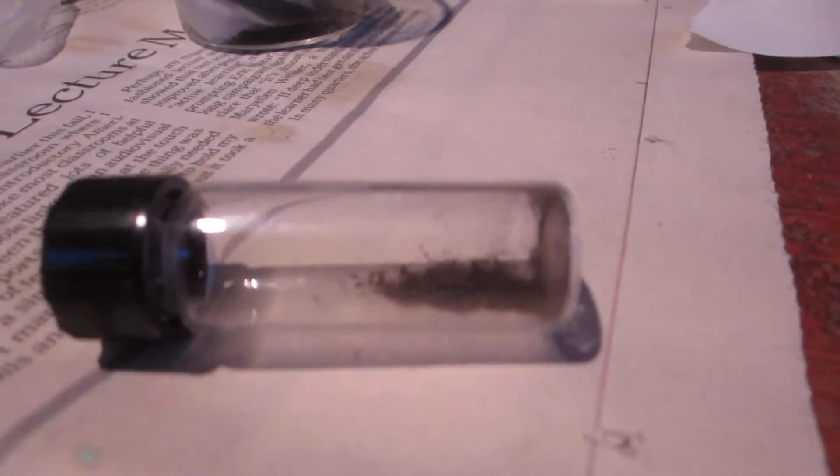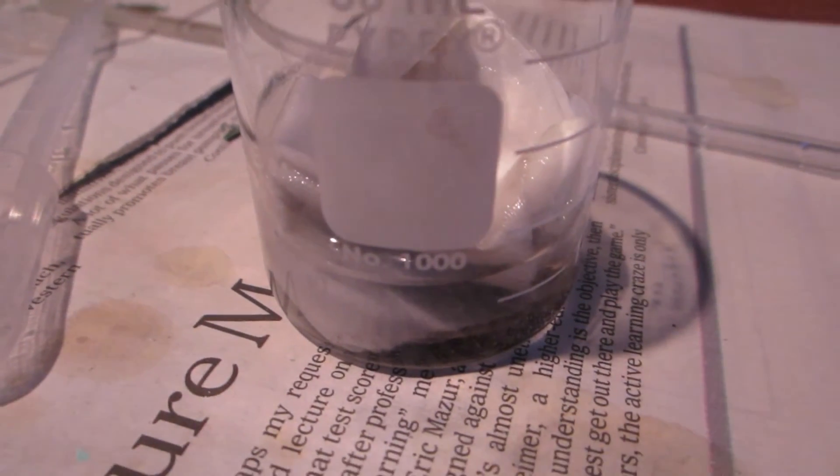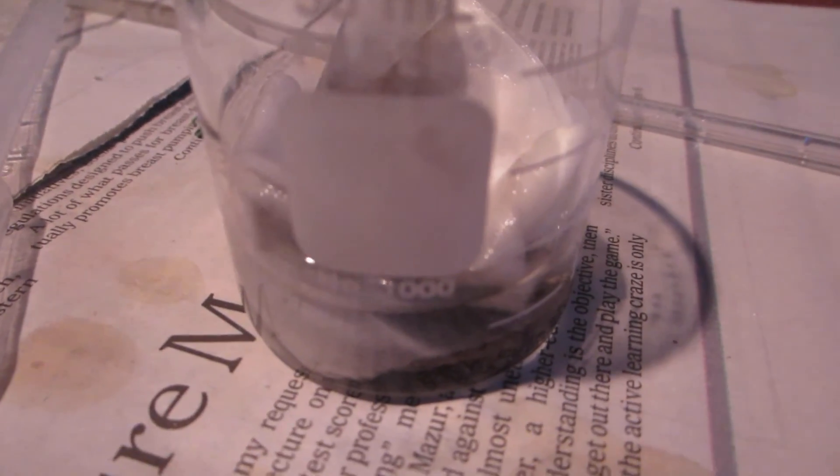This is the gold I recovered. A lot of it stuck to the filter paper, so I'm going to dissolve it again in a mixture of hydrochloric acid and hydrogen peroxide, then precipitate it out without filtering so it doesn't stick to the paper.